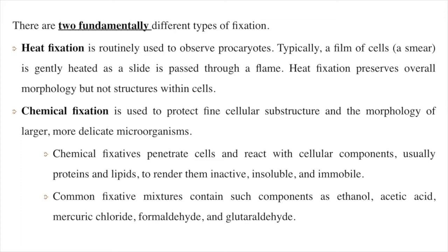What are the cellular components? Proteins and lipids. The fixatives react with the proteins and lipids and make them inactive, insoluble and immobile. So the cell is fixed on the microscopic slide. The common fixative mixtures contain components such as ethanol, acetic acid, mercury chloride, formaldehyde and glutaraldehyde.